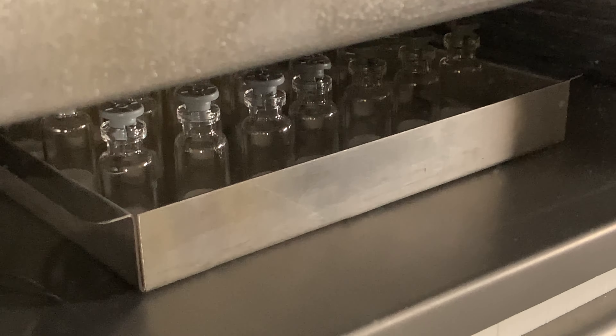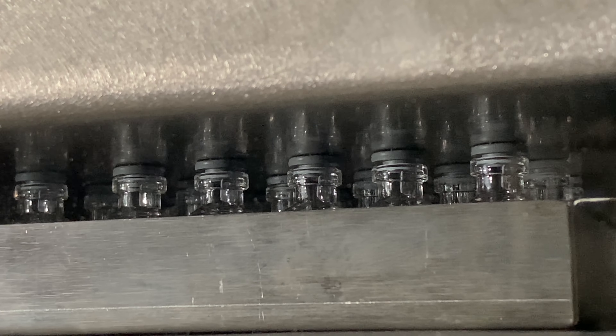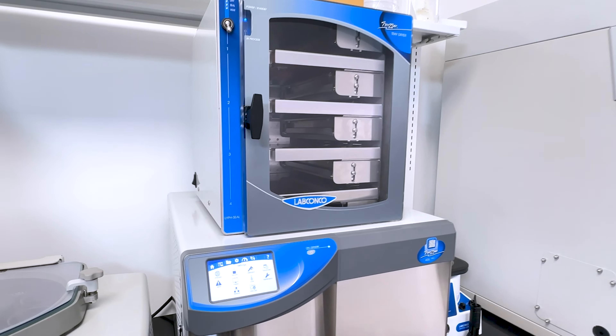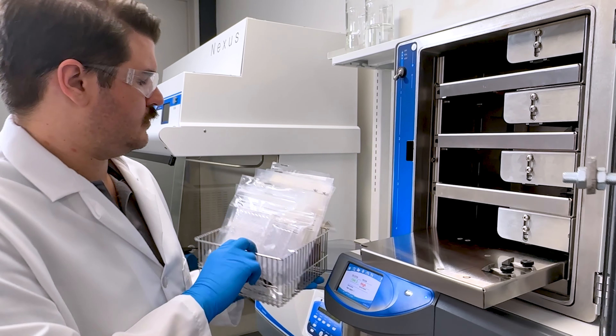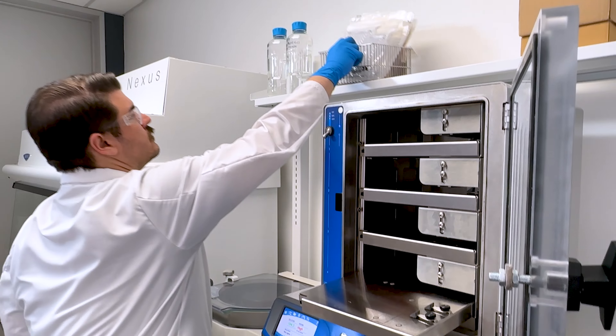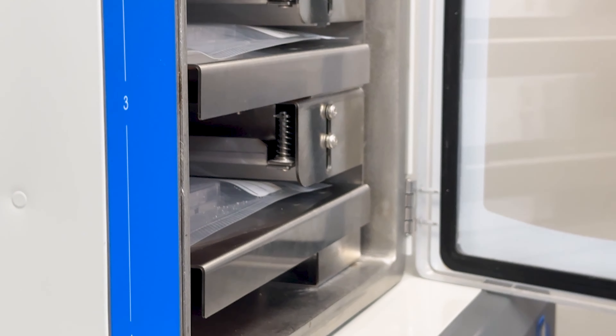Traditional preservation methods require samples to fit within glass serum vials or ampoules — until now. The Lyph-Seal Tray Dryer was designed with versatility in mind, allowing large volume, odd-shaped, and individually packaged samples to be protected from premature degradation.